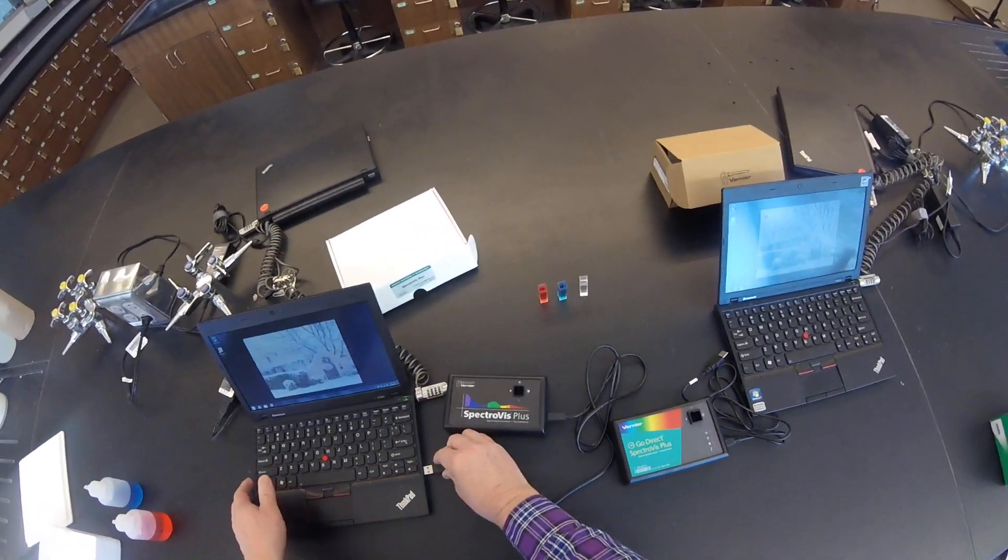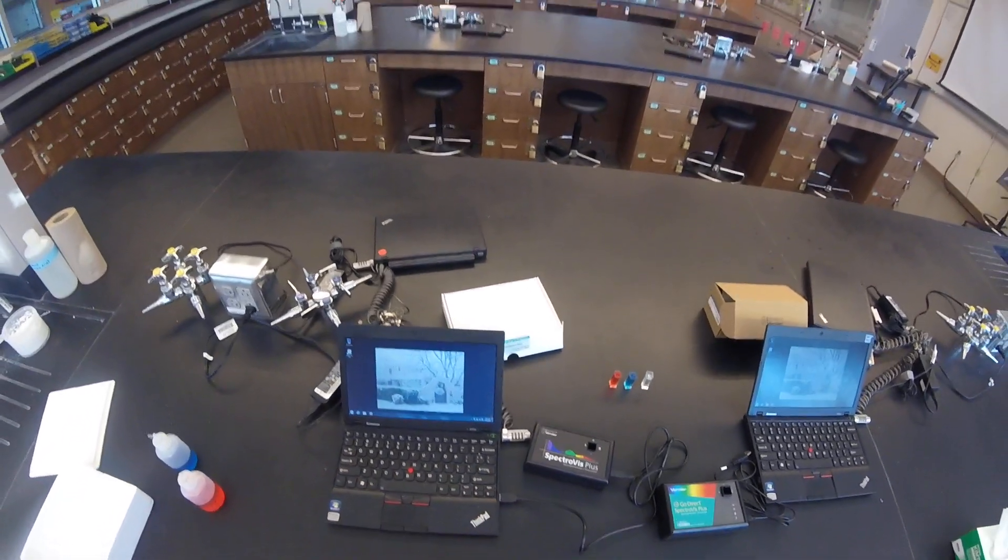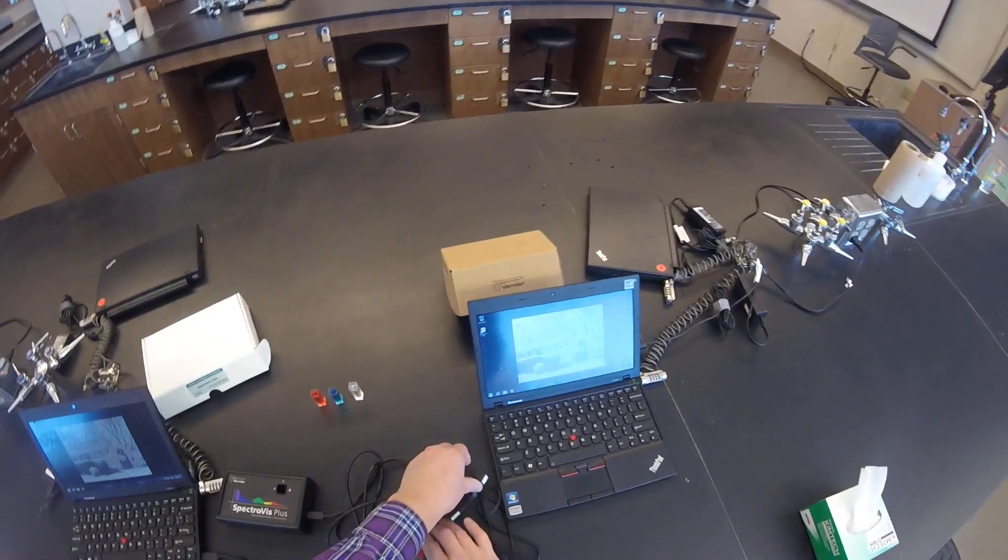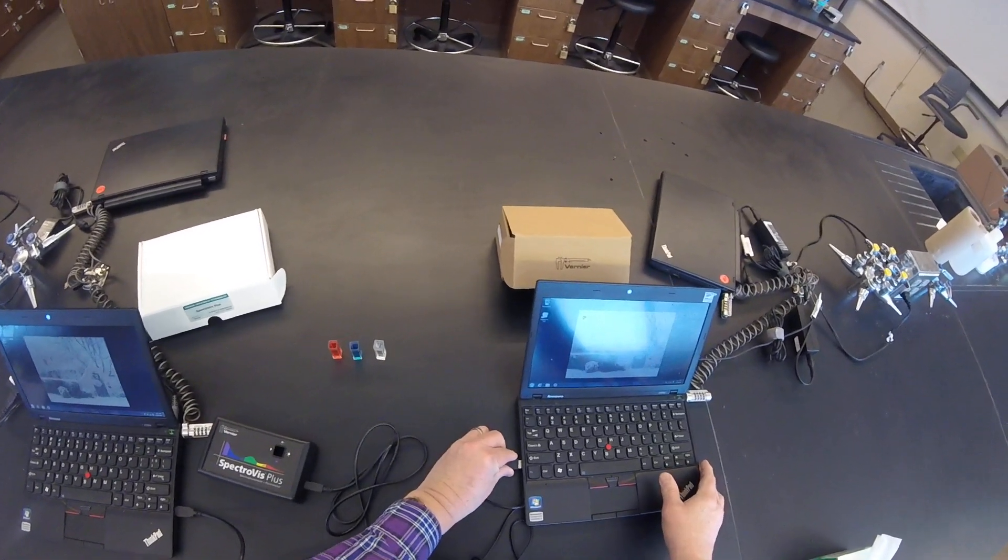I've gone ahead and launched a student account on both of these systems. What I'll do now is connect the SpectraVis Plus through USB as well as the GoDirect through USB.